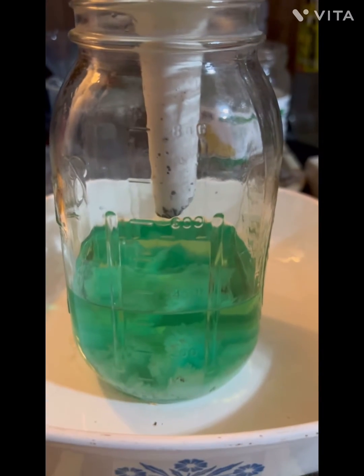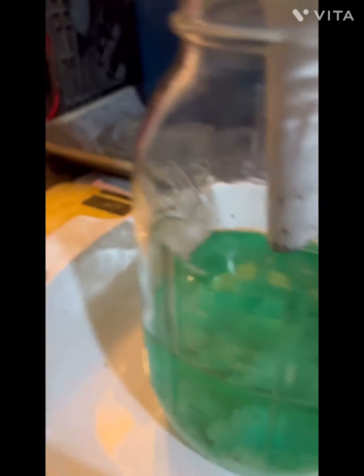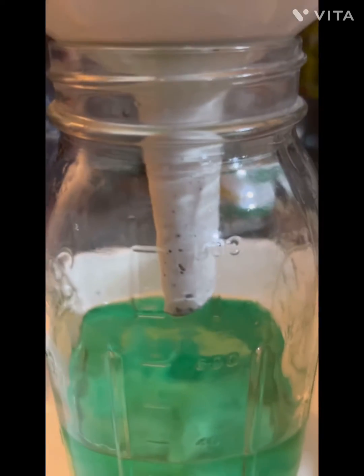Well there you go — ferrous sulfate! These crystals look really good, man. They're starting to fall out of solution. I'm going to let it settle tonight, but I'm real happy with that.